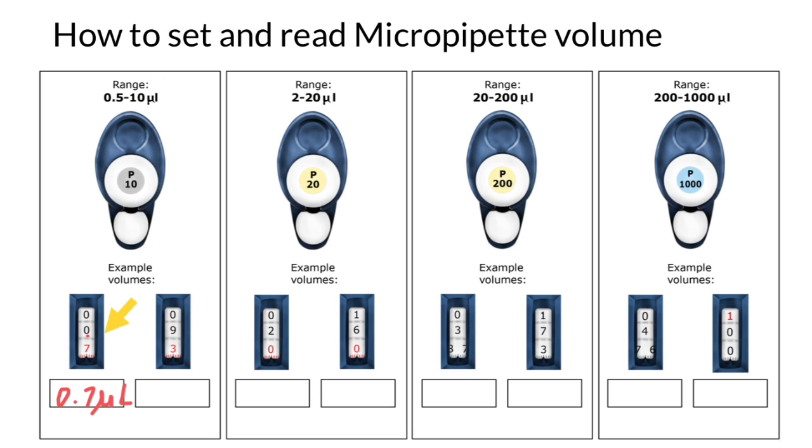Again, we just put here a decimal point between nine and three, between black and red numbers. And now we understand that this is 9.3 microliters.